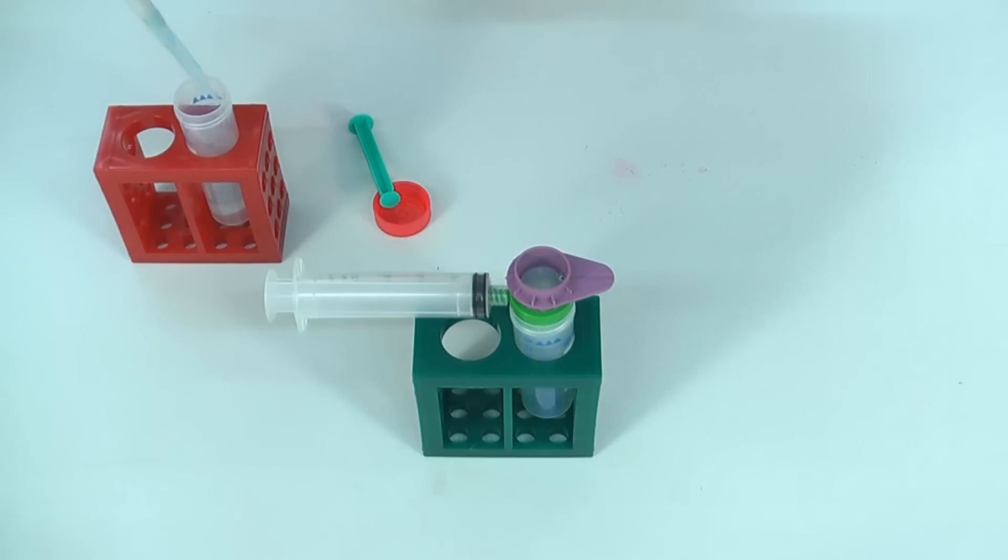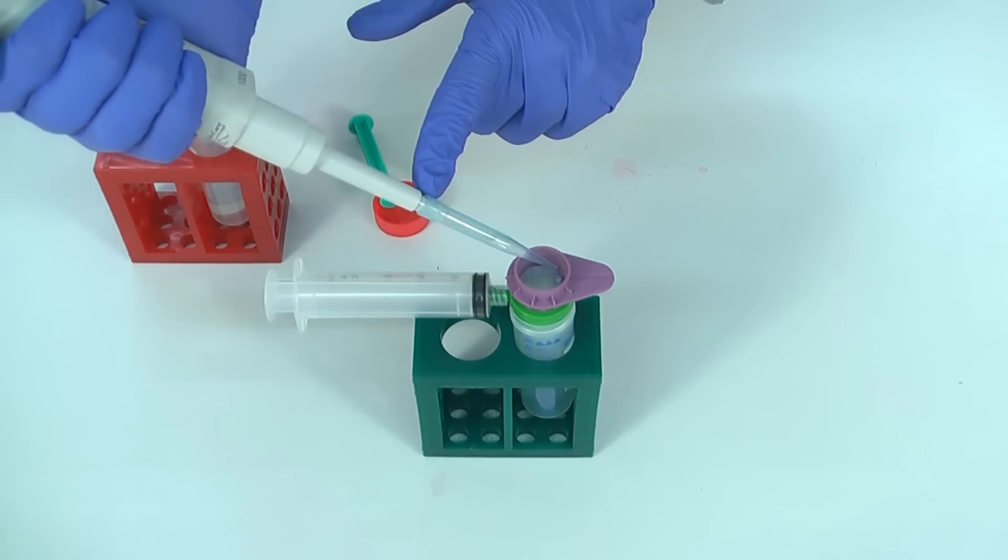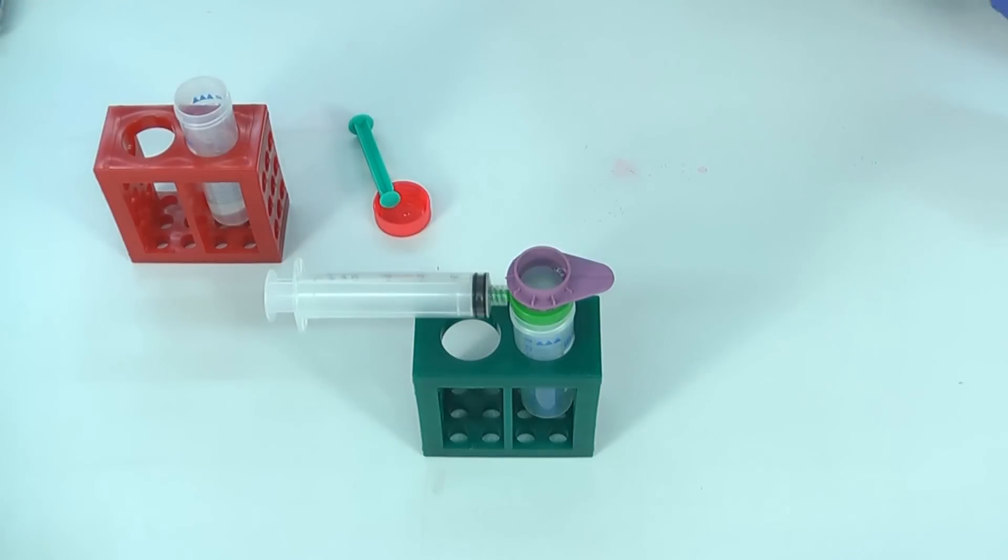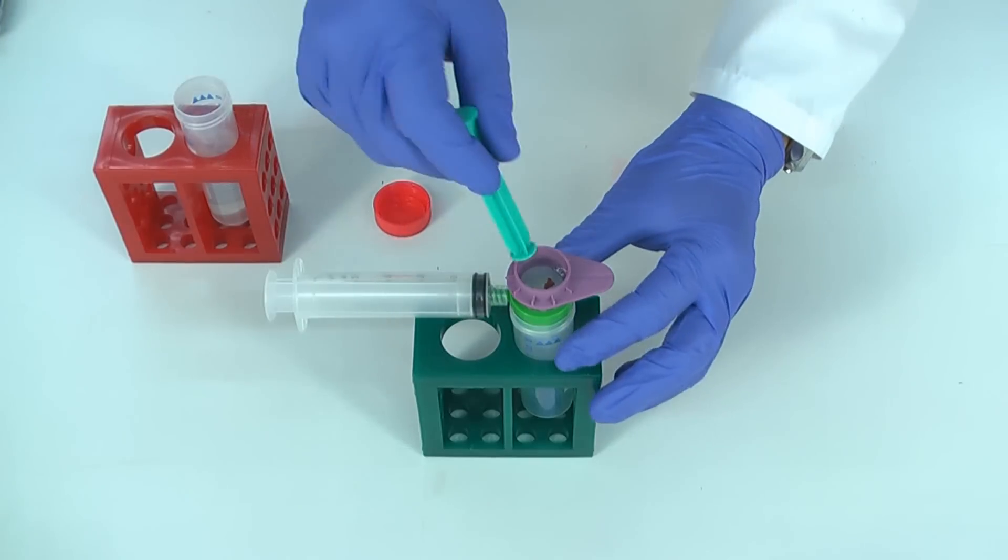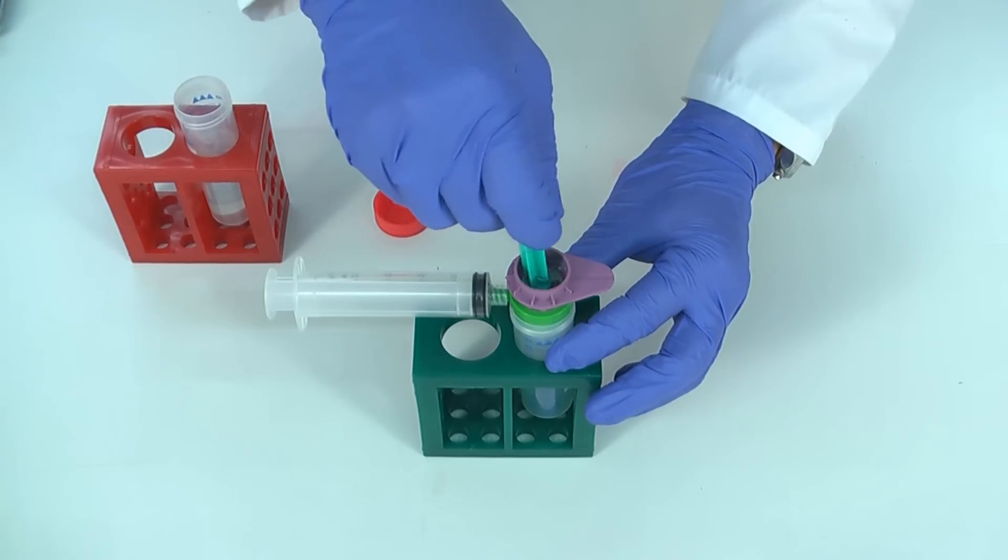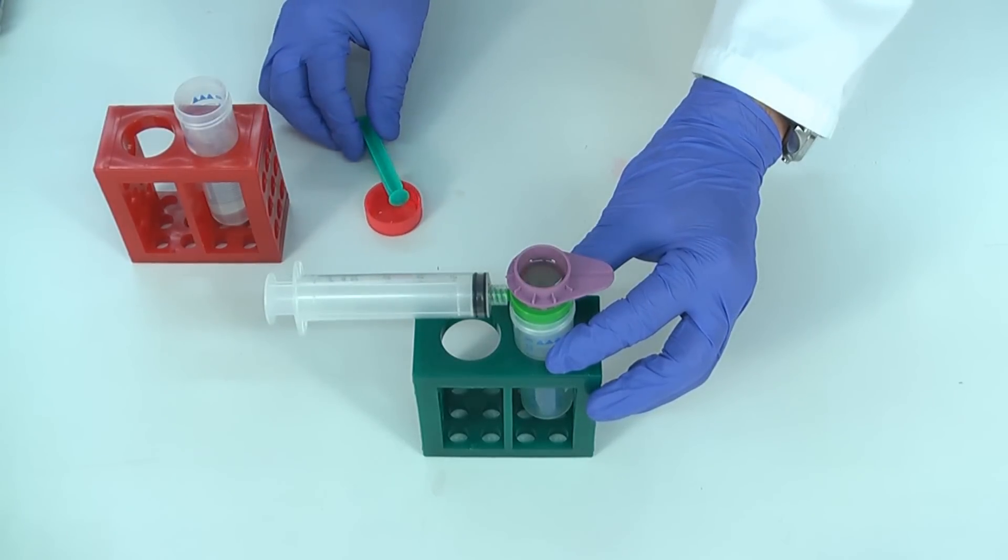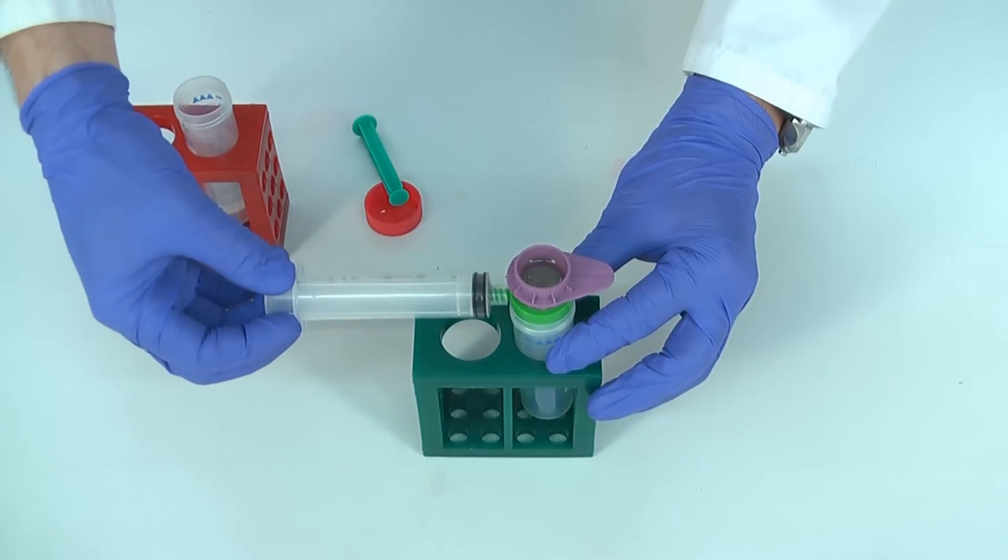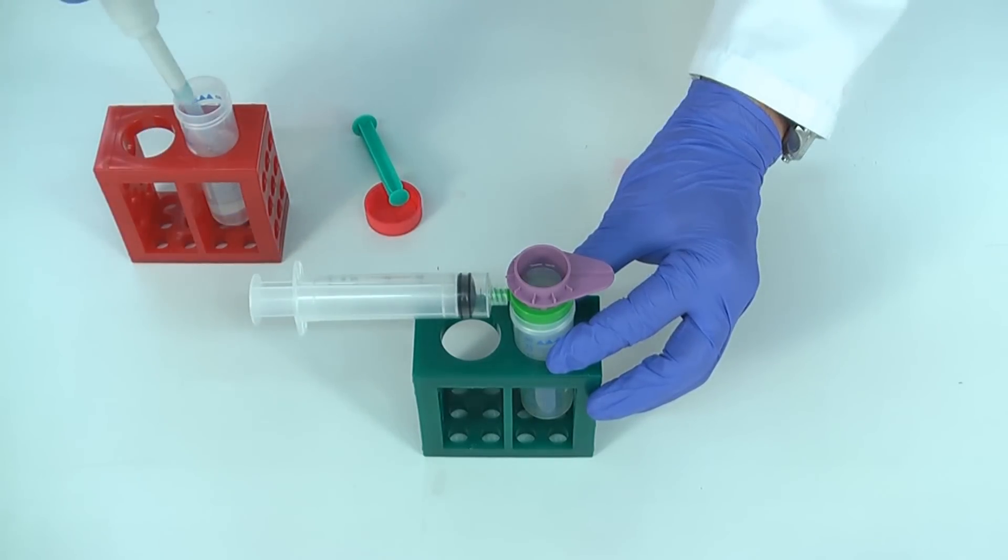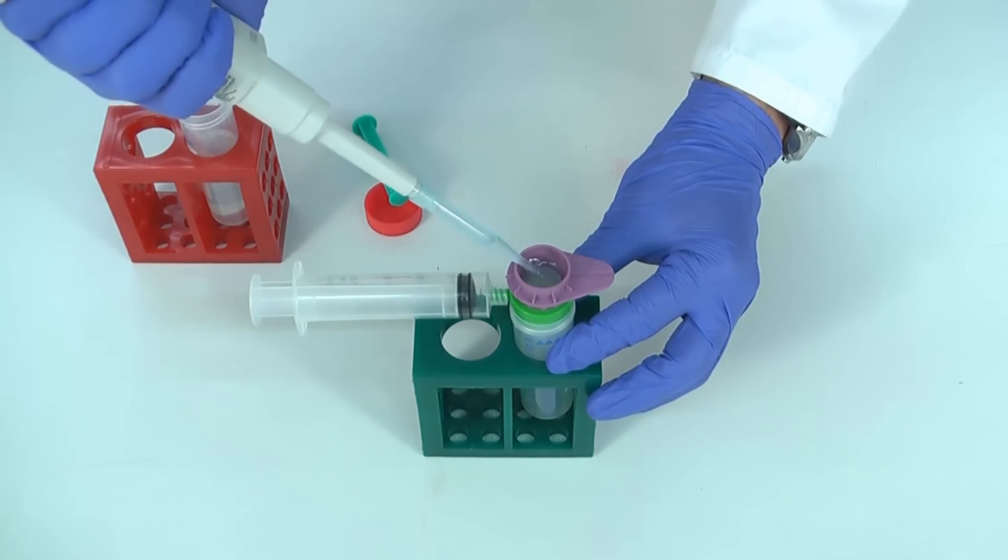In this example, we show you how to disrupt mouse spleen with the help of our pluriStrainer to prepare a single cell solution. First combine connector ring, tube, pluriStrainer and syringe. Add buffer and some of your mouse spleen. You can use, for example, a syringe piston to pound the spleen on the strainer. Pull the syringe piston a little bit. Repeat the steps as shown in the video.